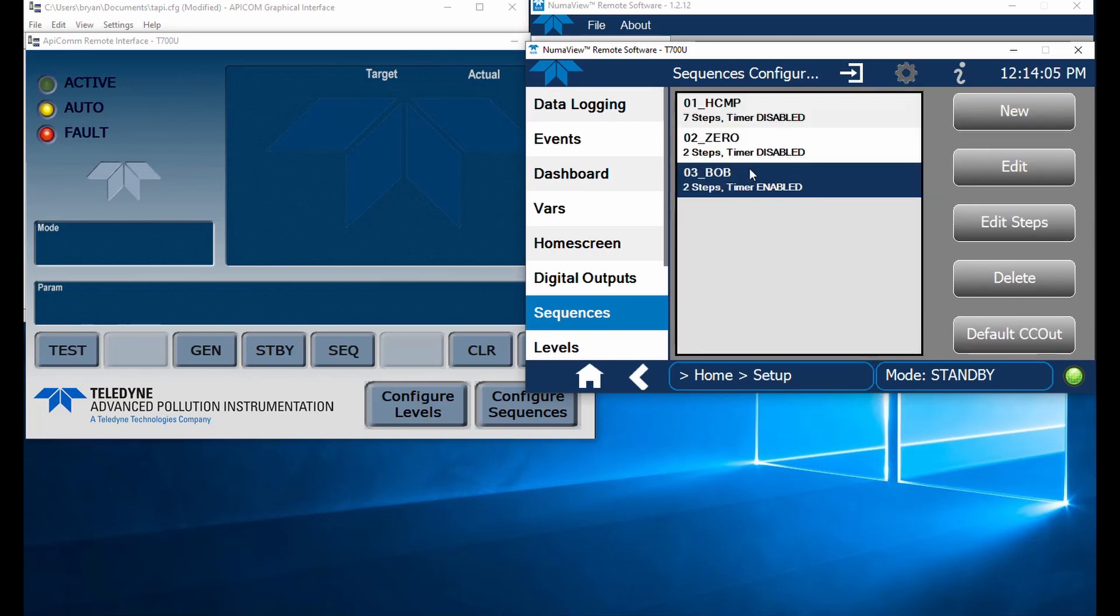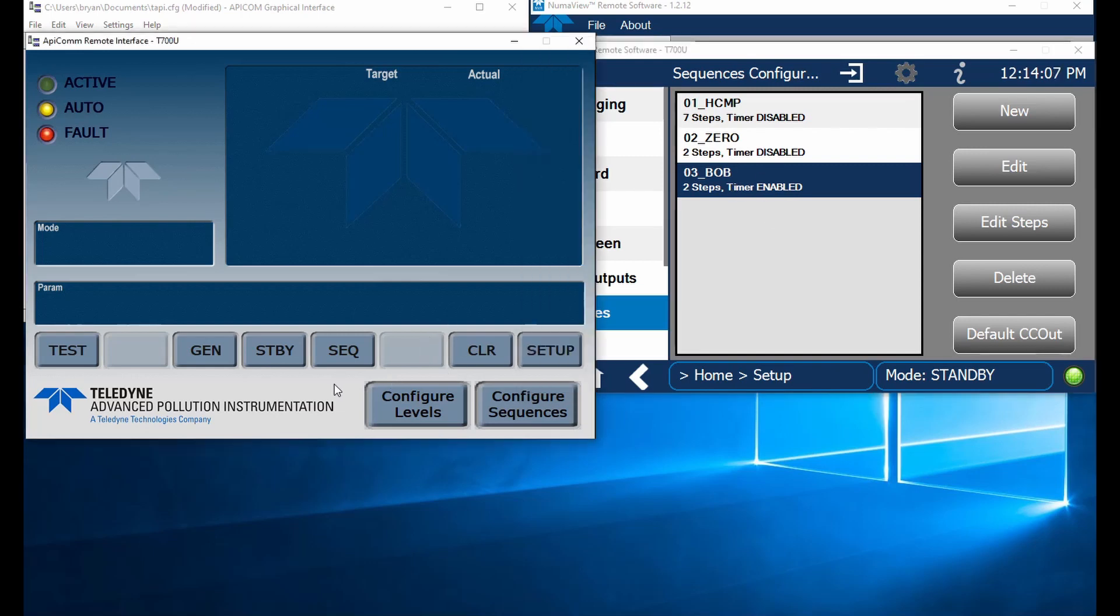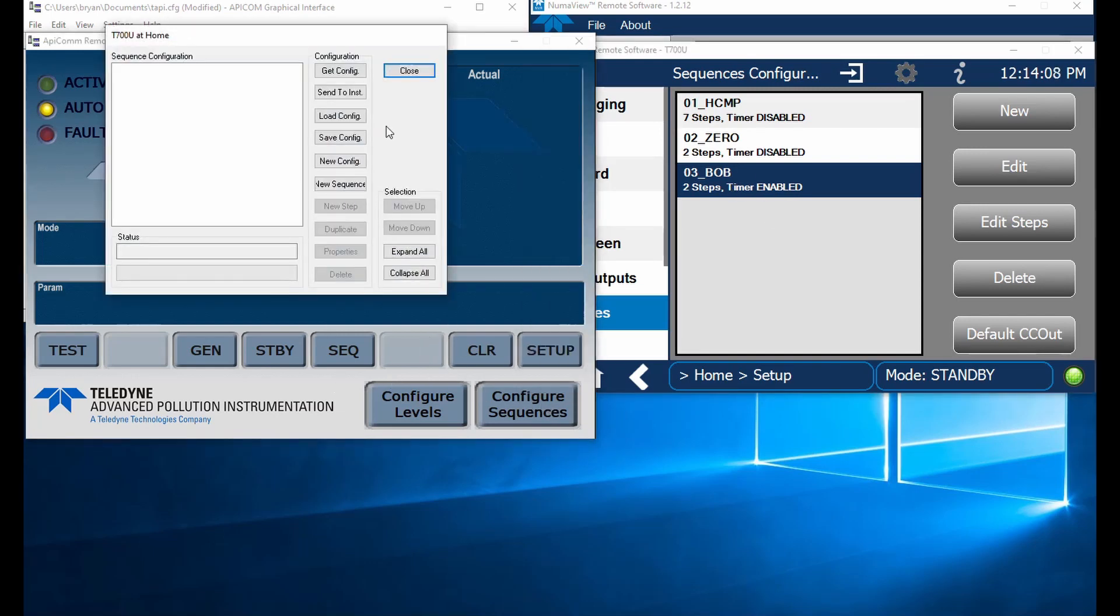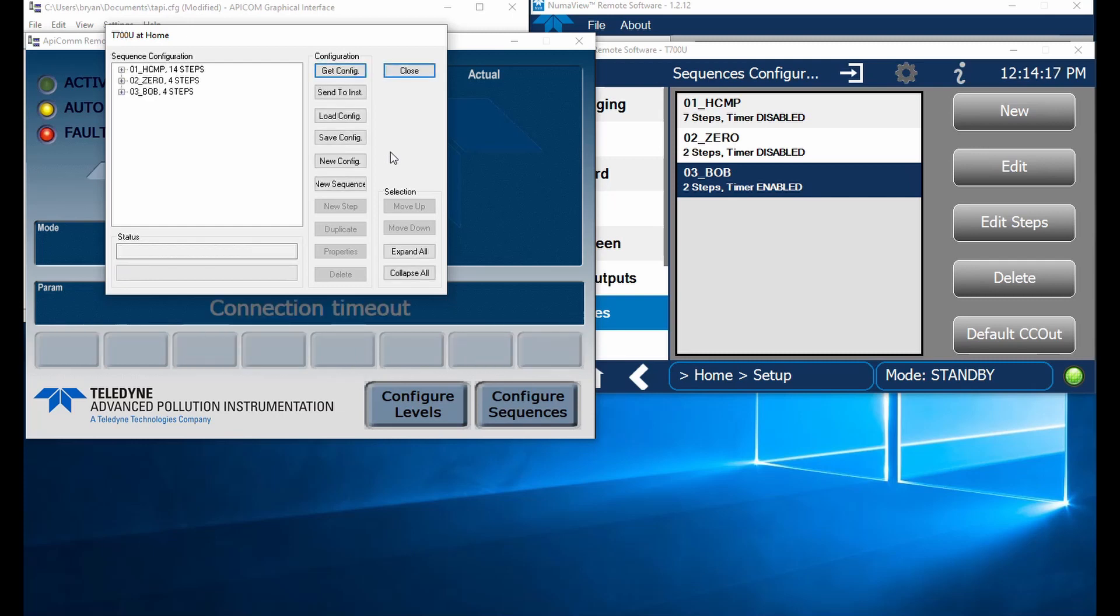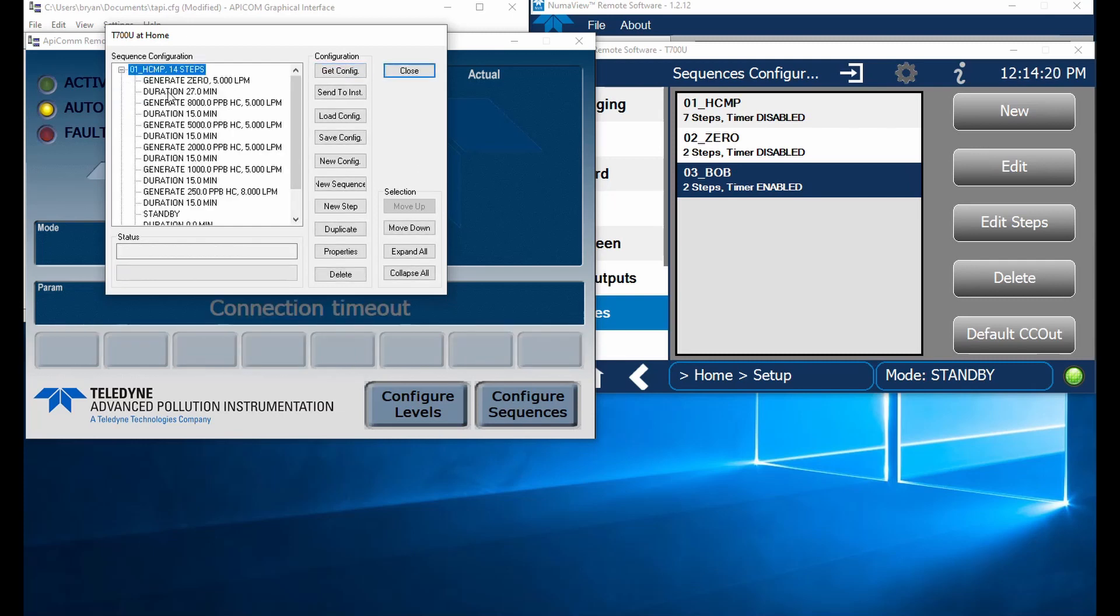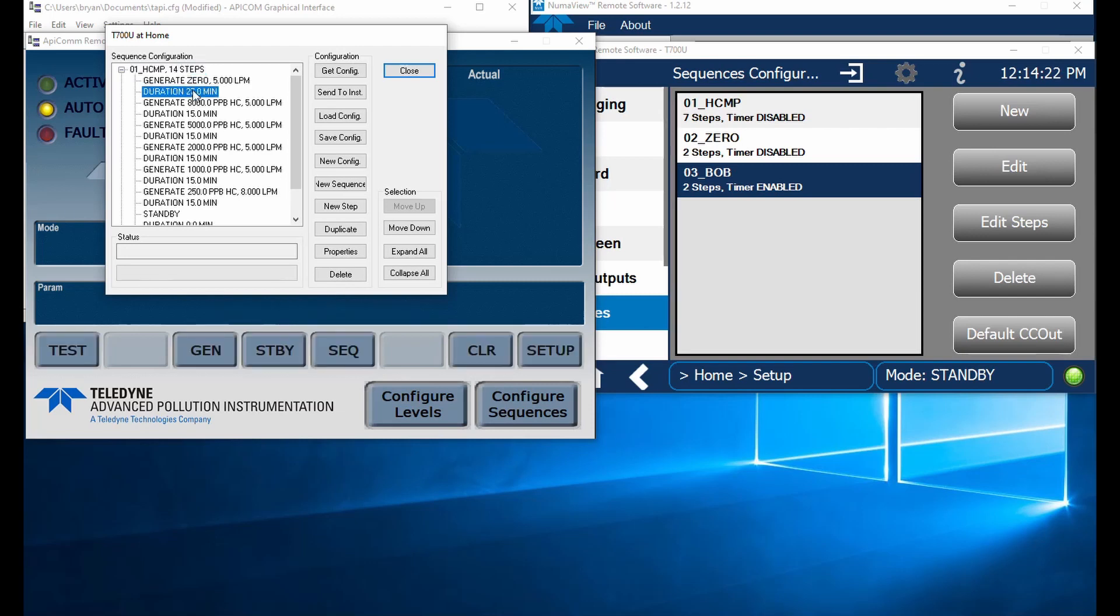When we come over to our Apicom and we click this configure sequences and say get config, it's going to pull those sequences over into our Apicom. So there we go. We've got our three sequences. You can see we're generating.